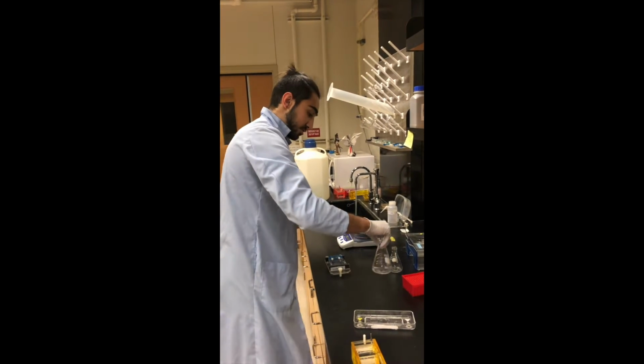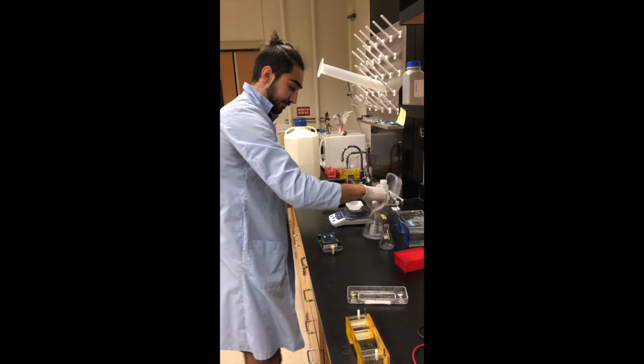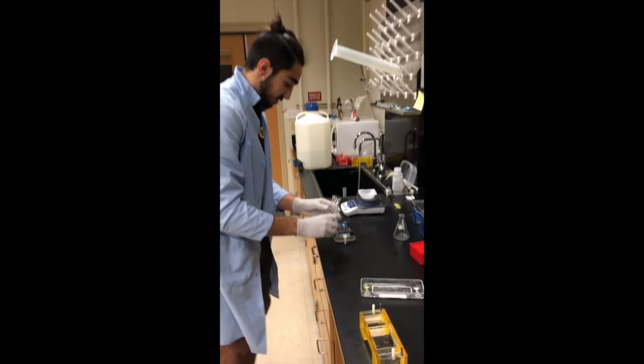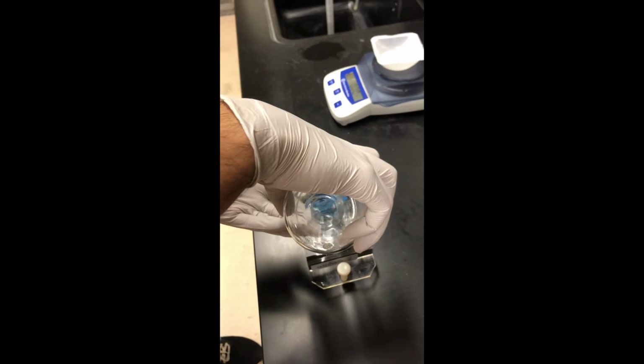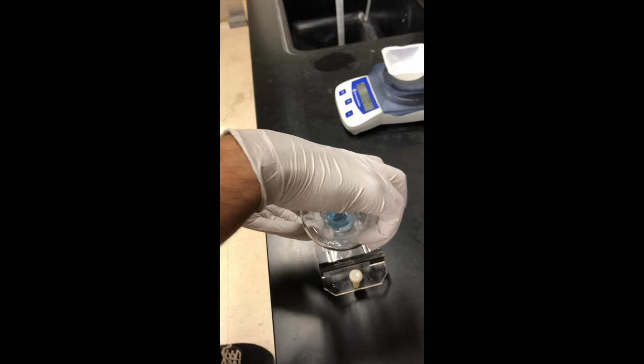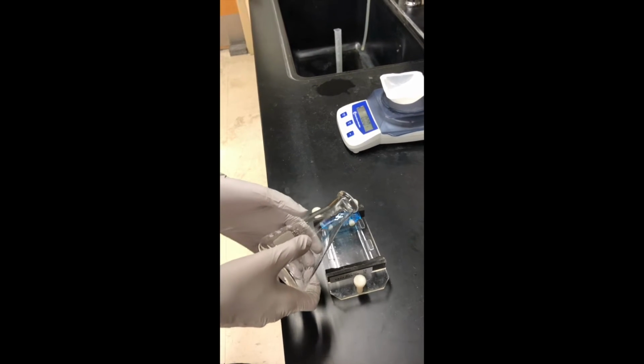And we're going to swirl it around. We're going to bring it around town. And then, voila. Into the gel tray it goes. And now we wait for it to solidify.